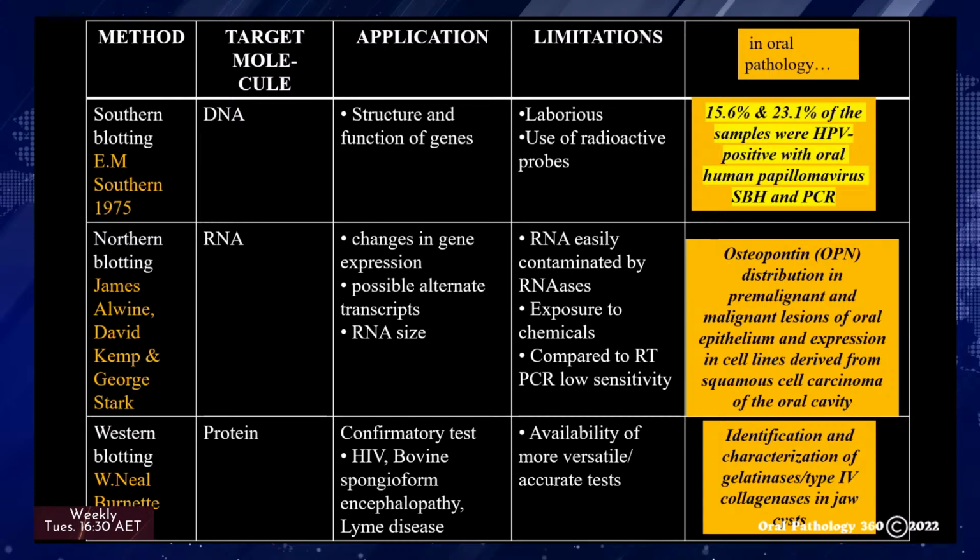Western blot is often used in research to separate and identify proteins. In this technique, a mixture of proteins is separated based on molecular weight and thus by type through gel electrophoresis. These results are then transferred to a membrane producing a band for each protein.